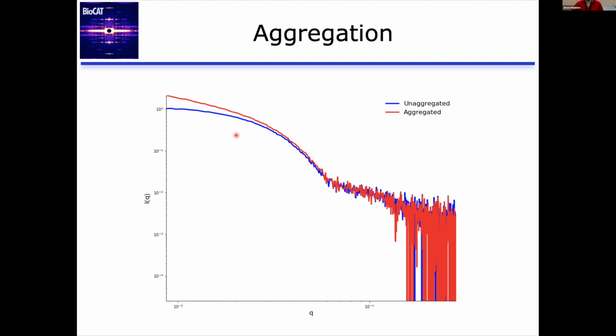I'm actually looking at the chat now. I have that up. So you can see there's a question: is this a lin-lin or log-log plot? So this is a log scale. You can see the ticks, if you can read the tick marks, are in decades: 10 to the minus 4, minus 3, minus 2, minus 1, minus 2, minus 1 here. So this is the log-log plot. That's a good question. I'm showing this to emphasize the change at low Q, which is why I use a log.